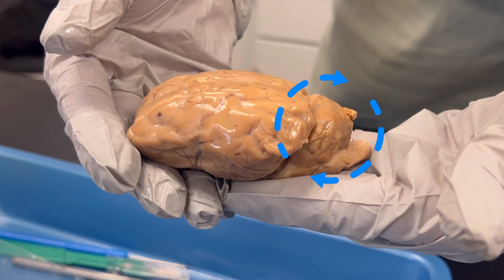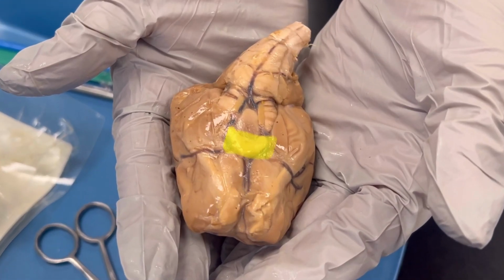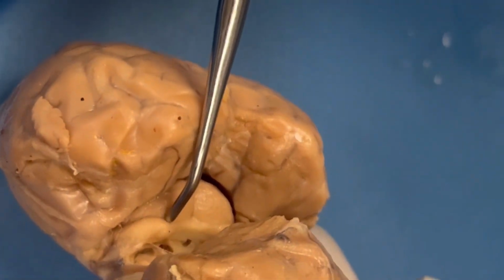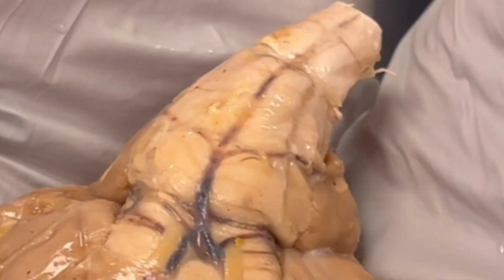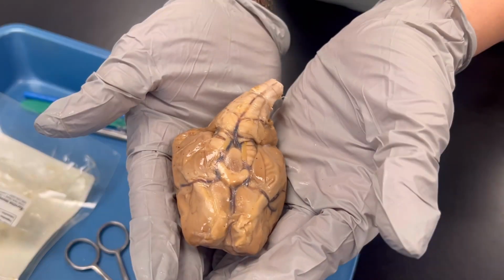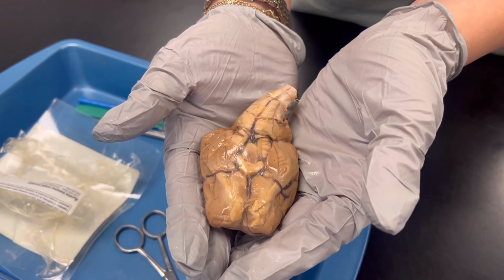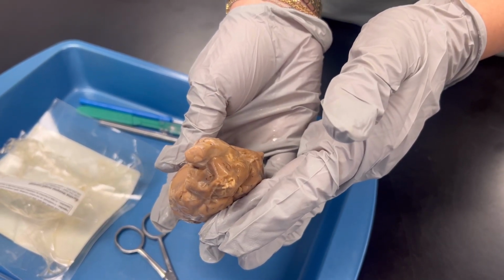Moving on to the cerebellum, the olfactory bulbs and tracts, the optic nerves and chiasm, the midbrain, pons, medulla oblongata, the decussation of pyramids, anterior median fissure, and lastly, the spinal cord. Just a side note, the spinal cord was cut and is not present in this brain. If it was present, it would be right around here.